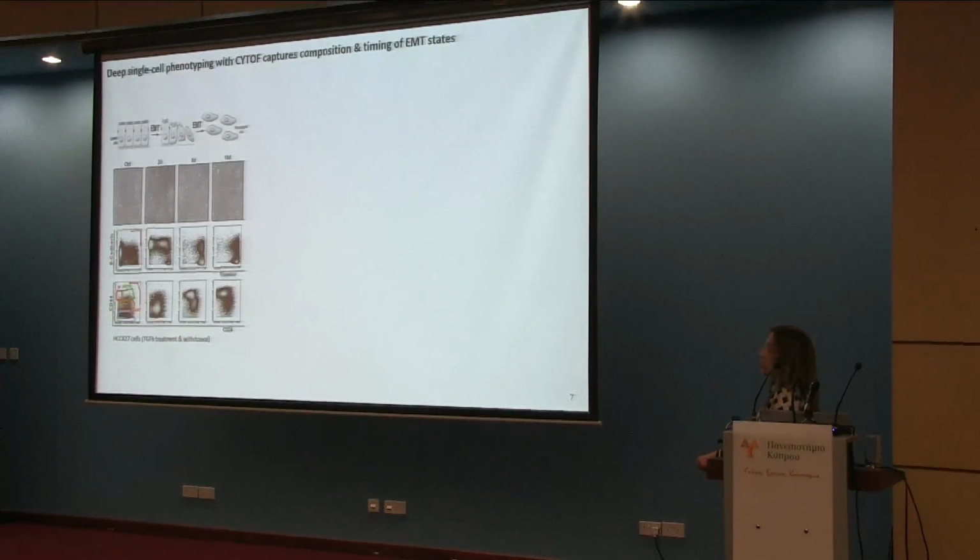Okay, so just to show you a little bit of the in vitro biological data, and I know the pictures are not great, I treated lung cancer cell lines with TGF-beta to induce this process here. And I know you can't see very clearly, but they dramatically change morphology. They become very mesenchymal. They detach, they're not forming colonies. And usually, traditionally, researchers use a couple of proteins that well describe this phenomenon. If you're high in E-cadherin, you're epithelial. If you're high in vimentin and have lost E-cadherin, you're very mesenchymal.